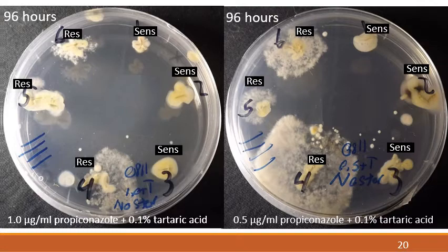Grass blades were sampled from replications of each isolate during the field trials. Isolates 1 to 3 are considered sensitive to DMIs, and isolates 4 to 6 are considered resistant. From our previous test, we would expect to see fluffy white growth consistent with that of the dollar spot fungus on isolates 4 to 6, with no such growth or very minimal growth on isolates 1 to 3, as shown in these images. However, the white fluffy growth is much more apparent on the growth medium on the right.